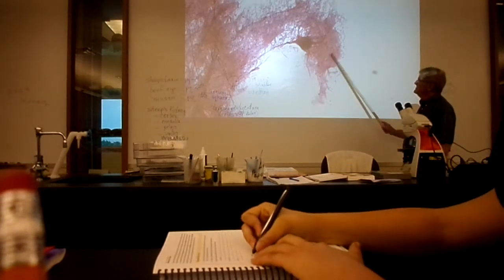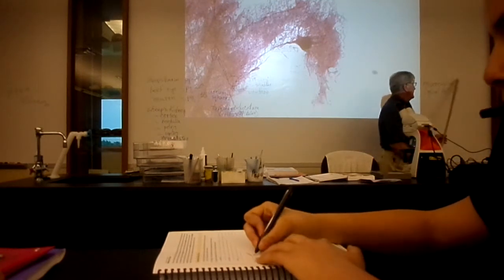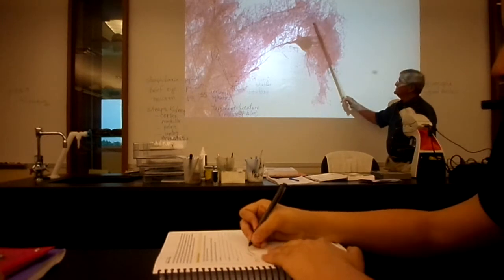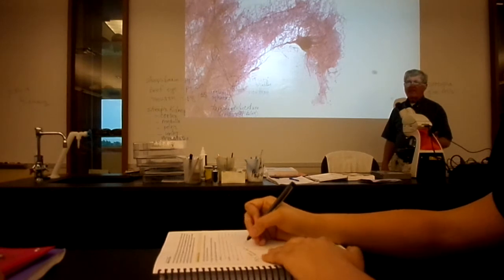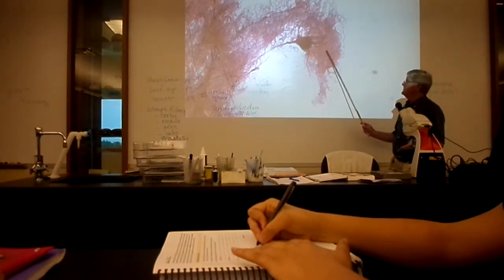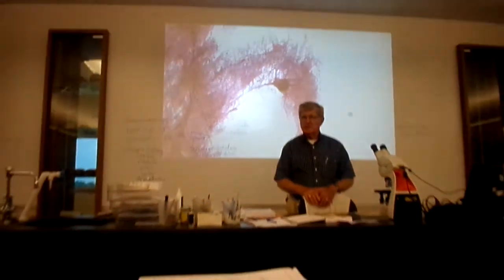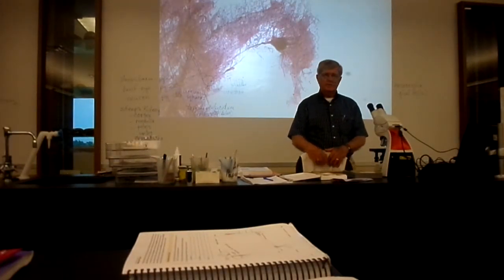And again, all of this other pink tissue that you see here is this neuroglia, and you can tell it's made of cells because what are all these dark objects that are small in size? Nucleus. What are these little dark things? They're the nuclei of those neuroglial cells. So there's a bunch of them there. And that's what you see whenever you look at a cross-section of a piece of brain or spinal cord, which is what this is.